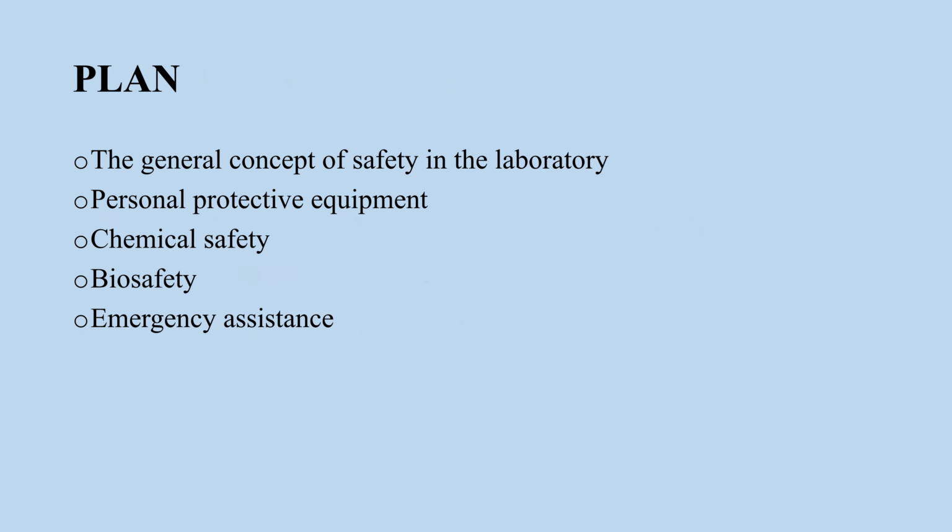It's a short plan for this lecture. I will talk about general rules, personal protective equipment, chemical safety, biosafety, and emergency assistance.